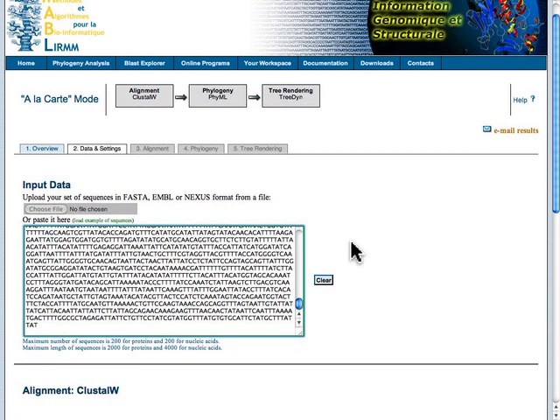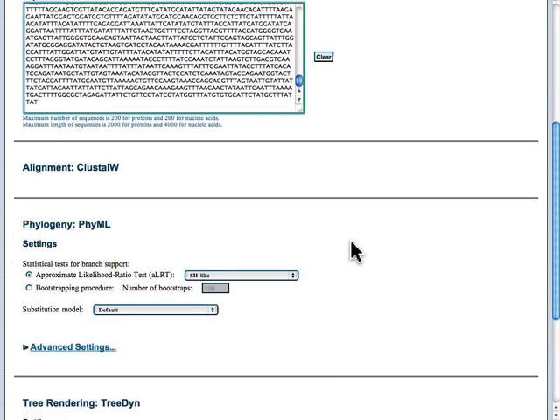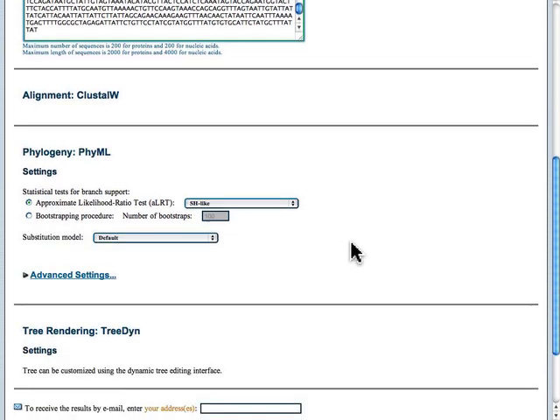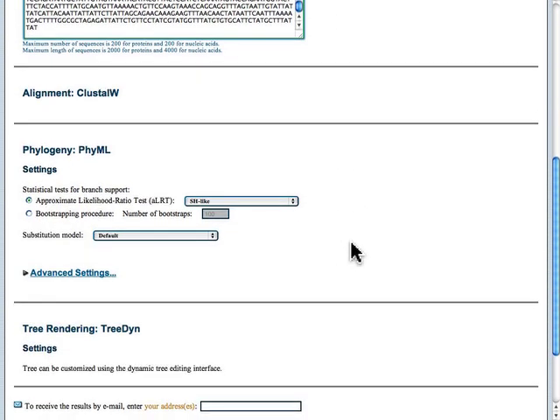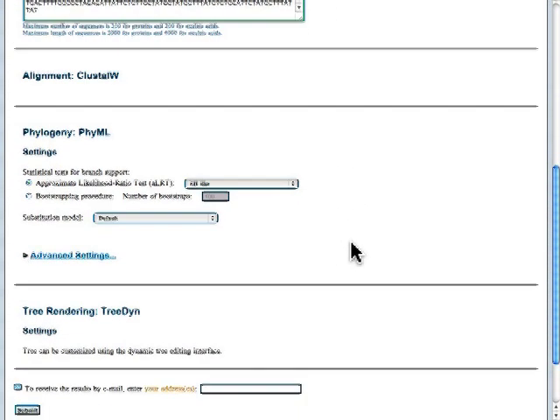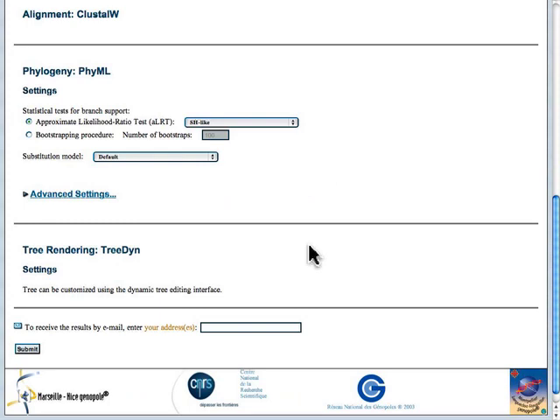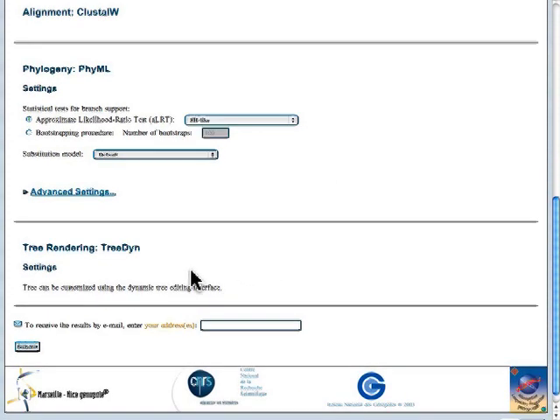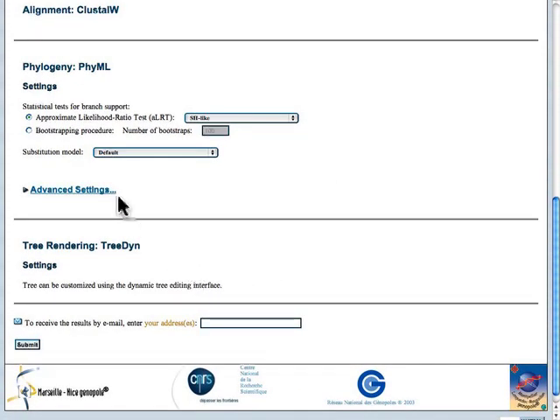Though you have to make sure that file is in a flat text format, not in a Word document, because Word carries a bunch of other information that the program can't interpret.